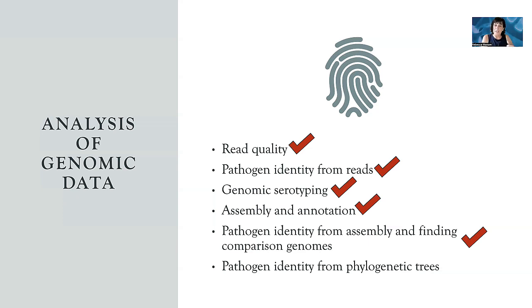O104H4. We assembled the genomes, we annotated the genomes, we did some things to see if we were right, if it was E. coli, like we blasted the 16S ribosomal RNA gene, and that came up as E. coli, and we also looked at MASH, min-hash, to see across the whole genome how strongly it was associating with E. coli. And looking across all the bacterial genomes in the Bioinformatics Resource Center, BV-BRC, and that was like a slam dunk for E. coli.